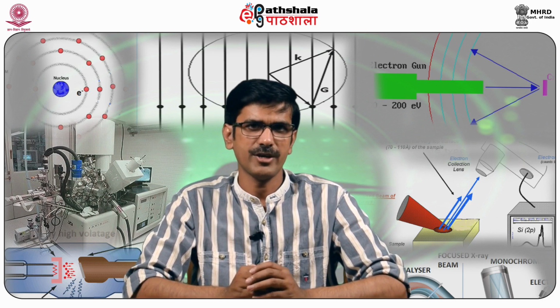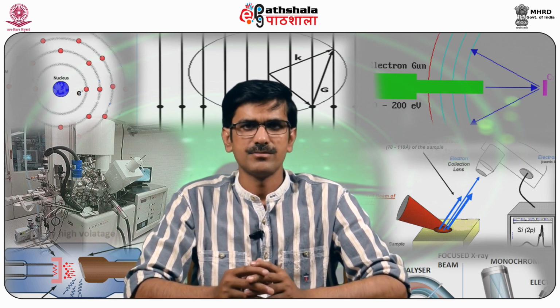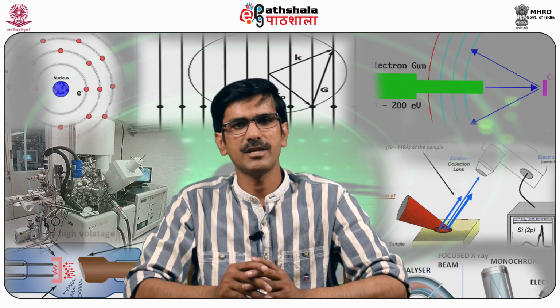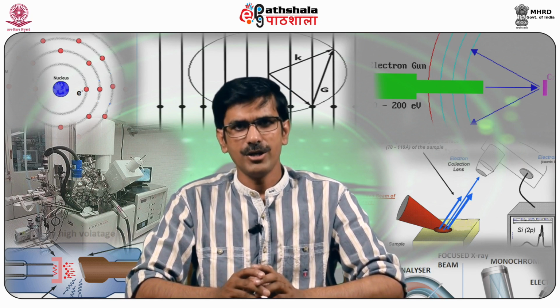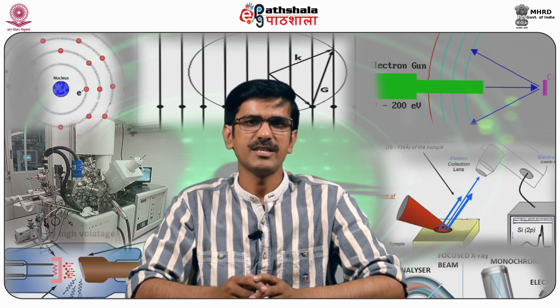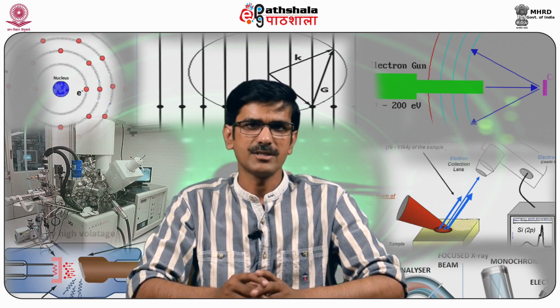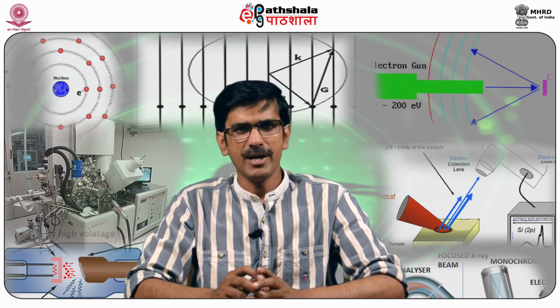So, students, let us summarize what we have studied in this module in analysis of EDX, or energy dispersive X-ray analysis data. EDX is an analytical technique that is used for the analysis of an element or chemically characterizing a sample. This is a non-destructive technique and is useful for studying a range of materials. Elements whose atomic number is less than 11 are difficult to detect by energy dispersive X-ray analysis, as the silicon lithium detector is protected by a beryllium window.